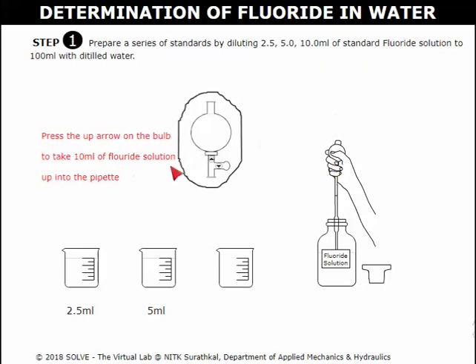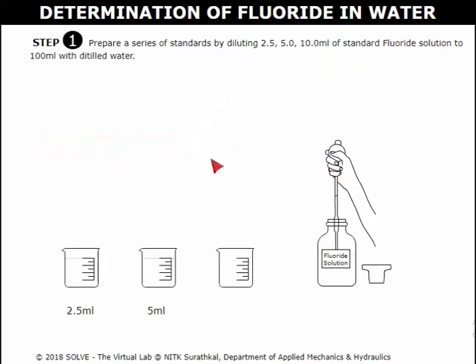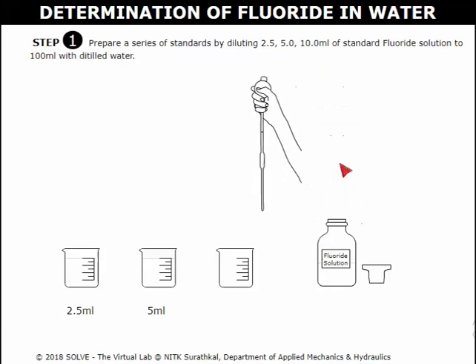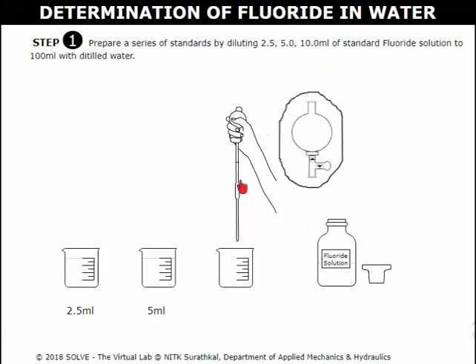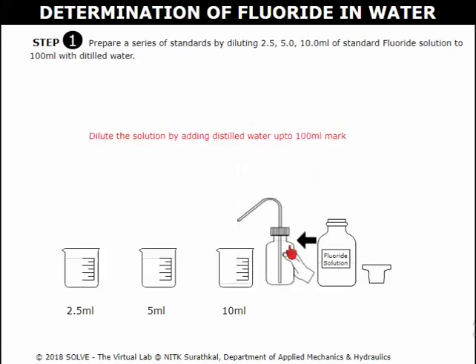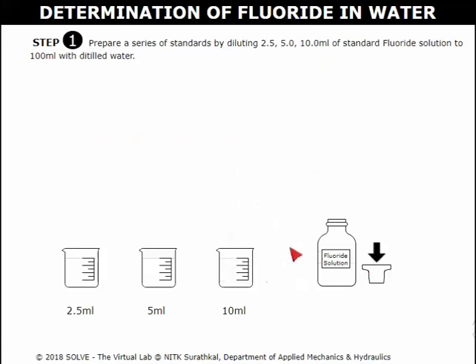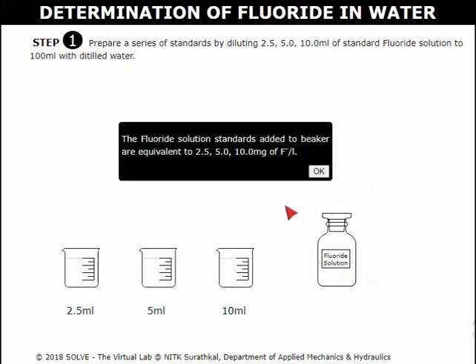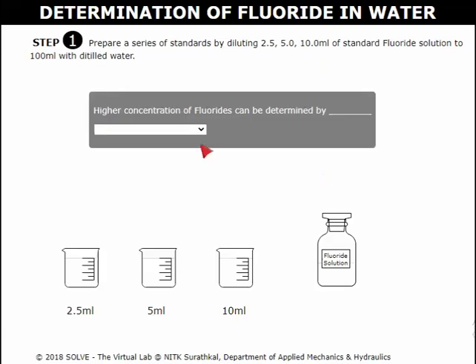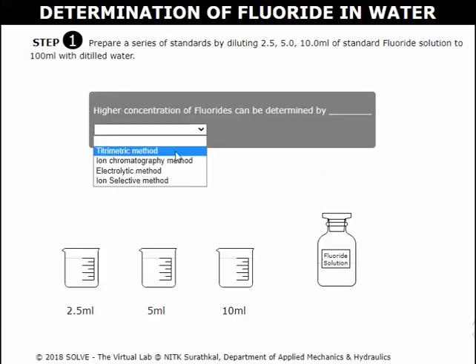Click here to pipette 10 ml of standard fluoride solution, then add it into another beaker and add distilled water into the beaker. Close the lid. Go through the instructions carefully. Select the correct answer for the pop-up question to proceed to the next step.